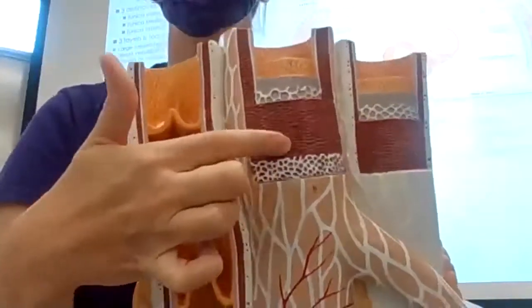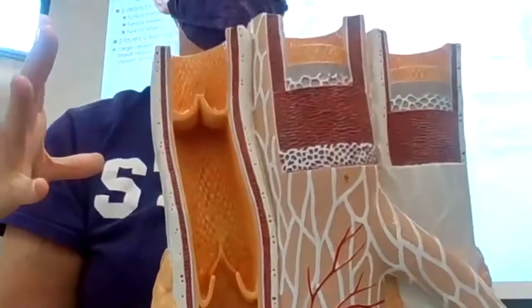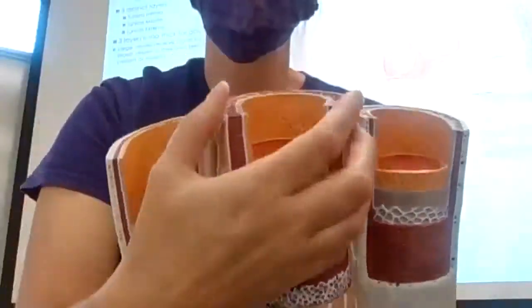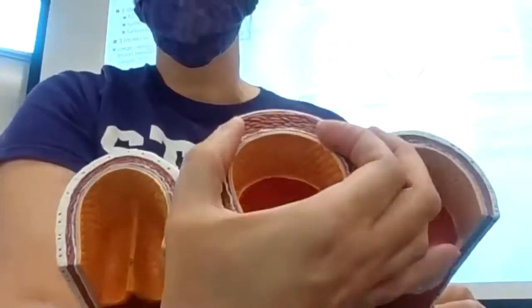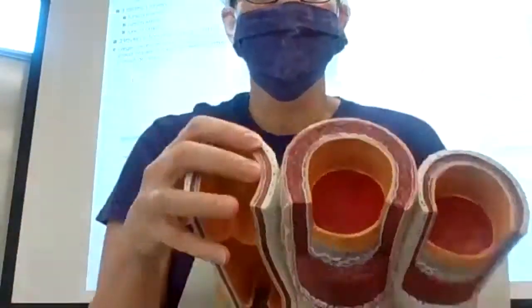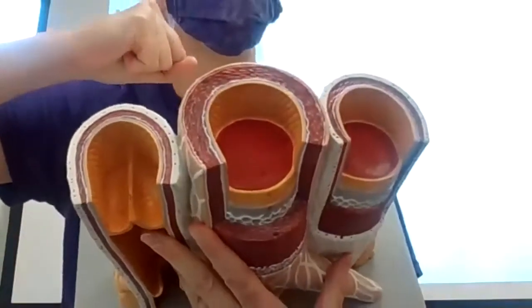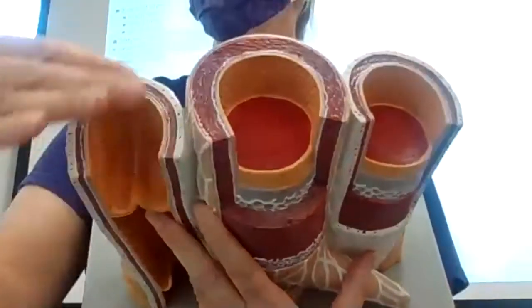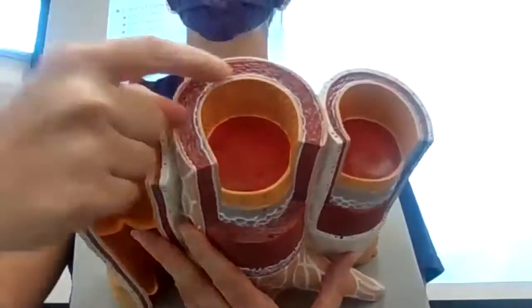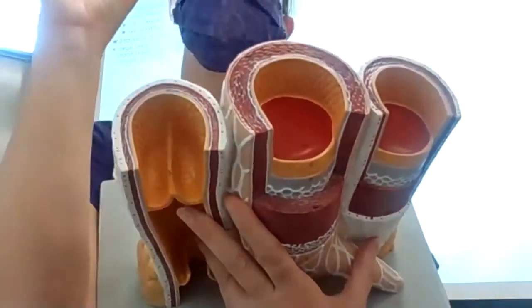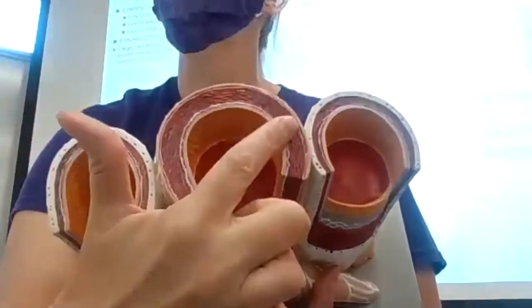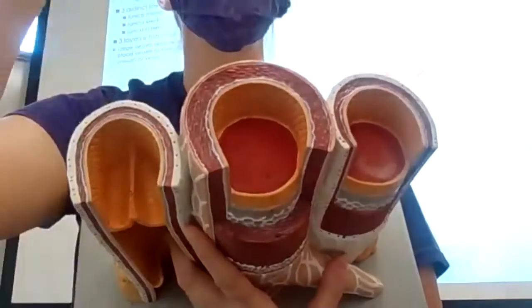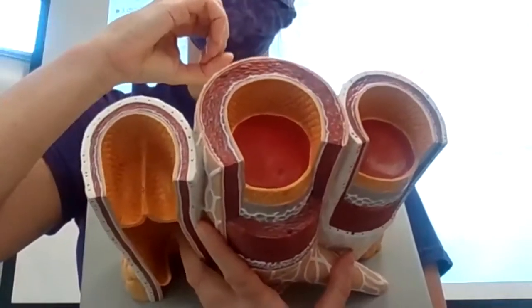So we'll have smooth muscle cells. And remember, smooth muscle cells are different from cardiac and skeletal muscle because some of them are going to be touching each other, some of them are going to be told to contract by the nerves, told to contract by hormones, told to contract by local factors like prostaglandin and histamine. And then some of them might also have a little automaticity, so they could also be spontaneously contracting. Because they're arranged in a circle, when they contract they cause the radius or the diameter to make this vessel get a little bit smaller in its lumen, or if they dilate, they get a little bit bigger. The smooth muscle cells' actin and myosin contract, they can stay in a contracted state. So if I have a hundred actin and myosin, maybe at some given point in time, 20 to 30 of them are holding that state of contraction. So smooth muscle cells are constantly being told contract a little more, more actin and myosin link up, contract a little less, they let the actin and myosin separate.